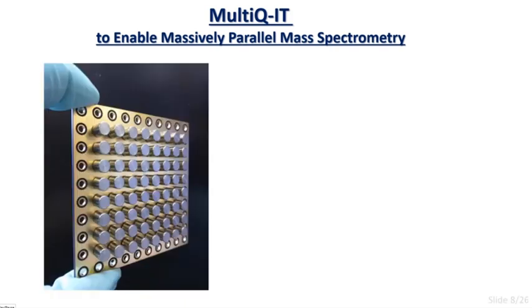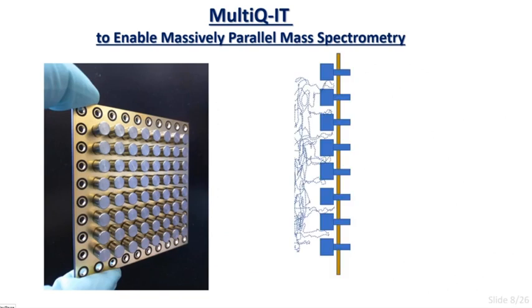This ion trap has several modes of operation. Let me illustrate that. When ions enter the ion trap, say with the energy of a few electron volts, they largely neglect the exits of the ion trap. But when they thermalize, they might start visiting the spaces between, and then will hit the supporting plate, for example.